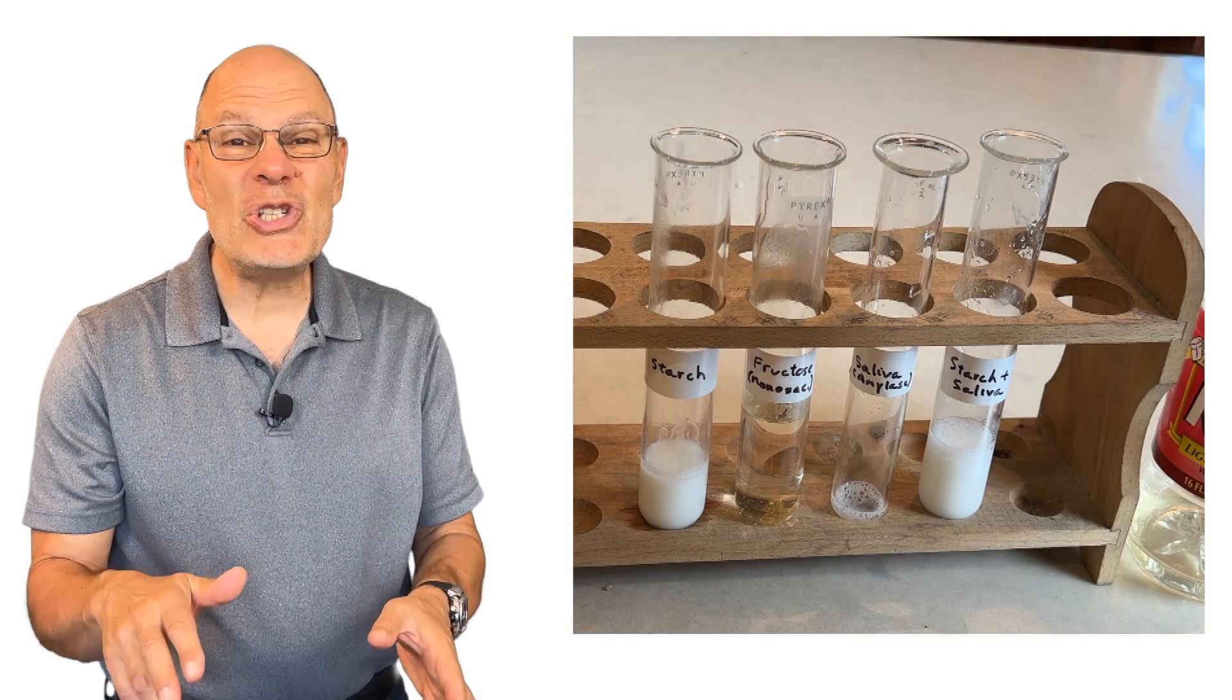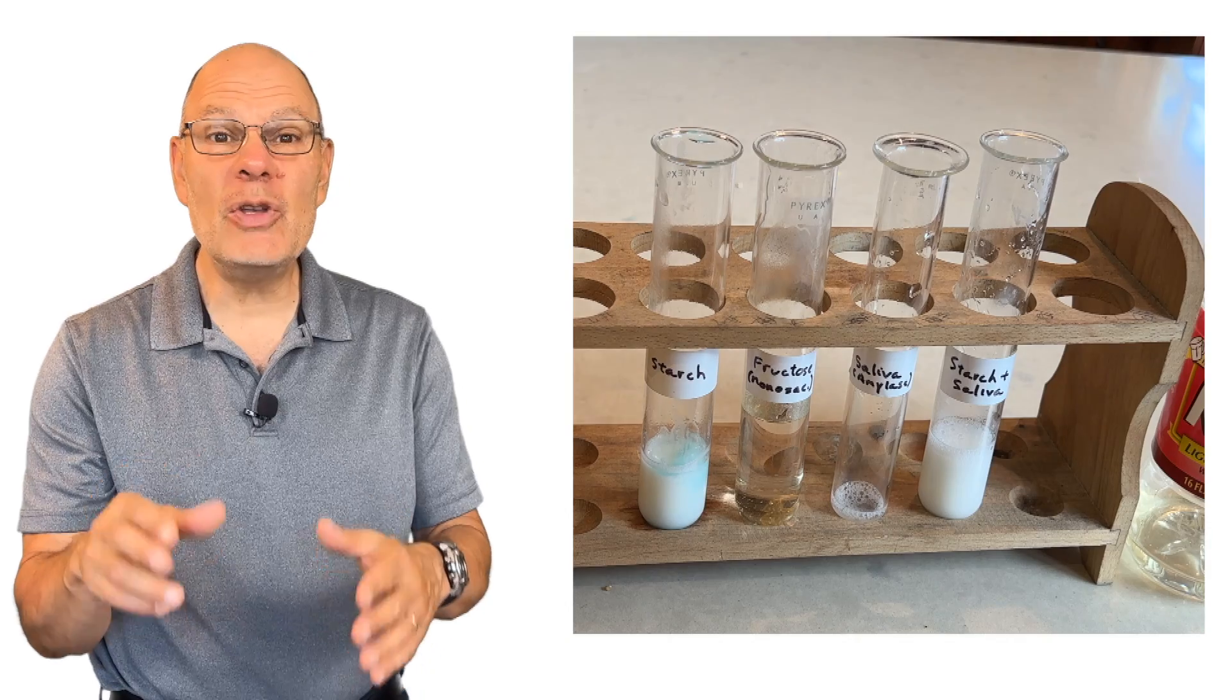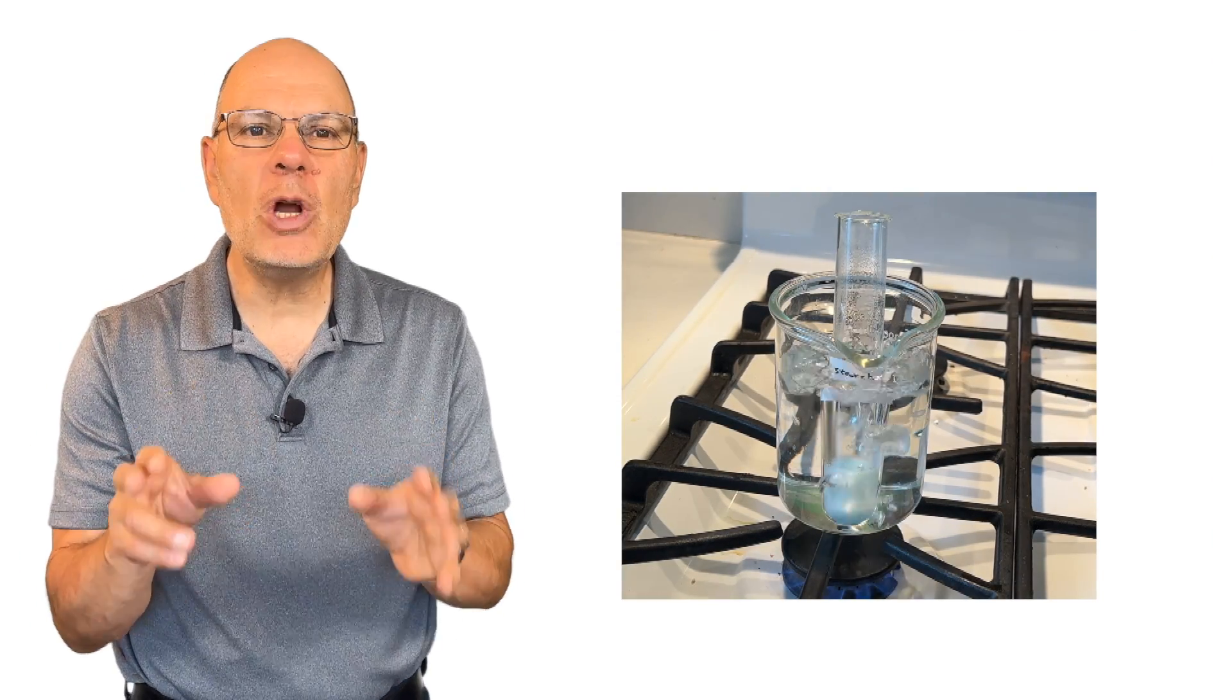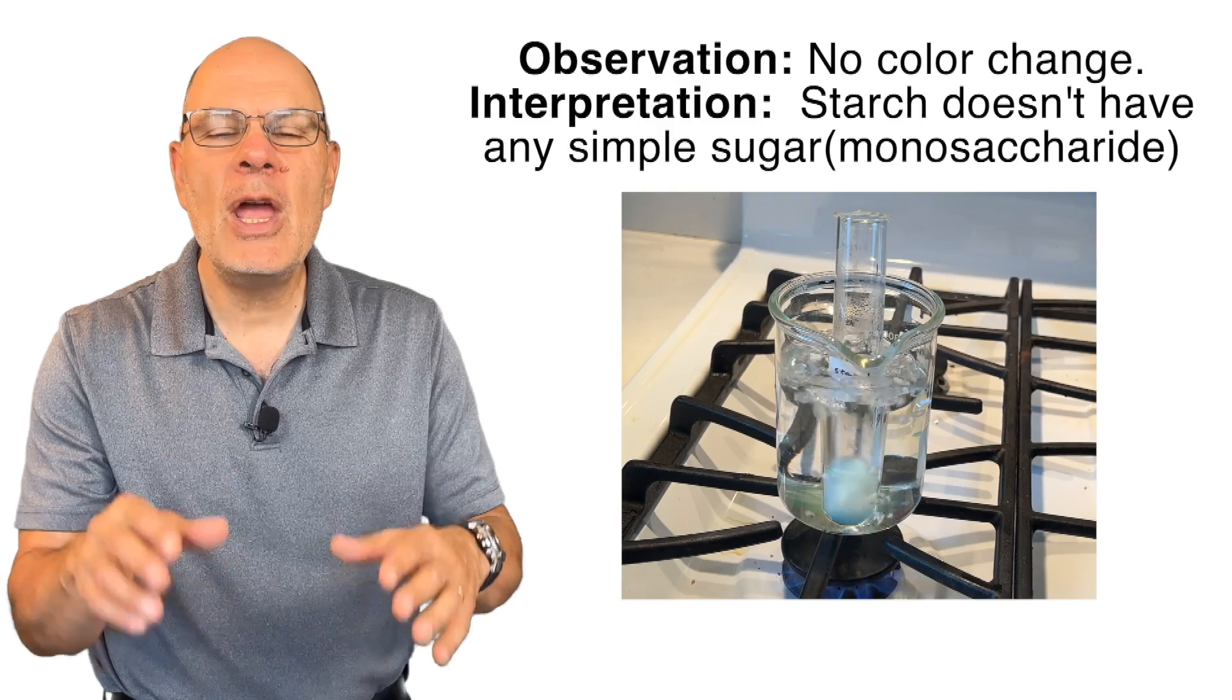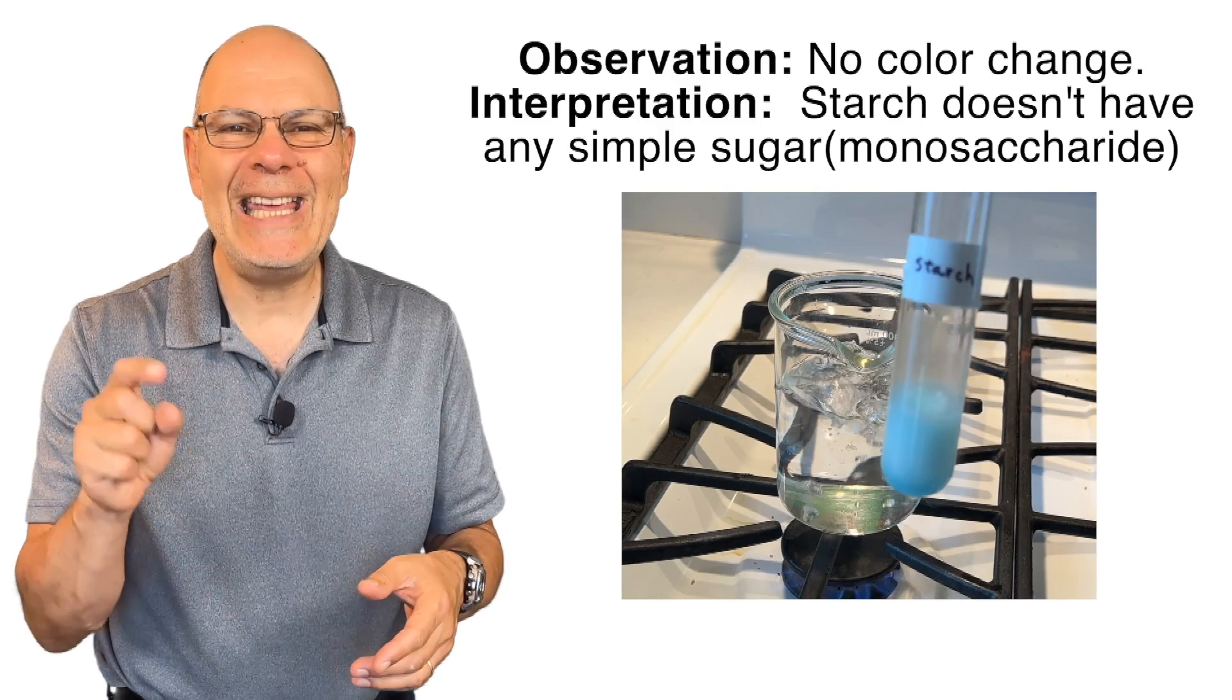Now let's test the starch solution, the one without saliva, to see if there's any glucose in that starch solution. We heat it up, and look, there's no color change. What's our conclusion? There's no monosaccharide, no simple sugar in starch.